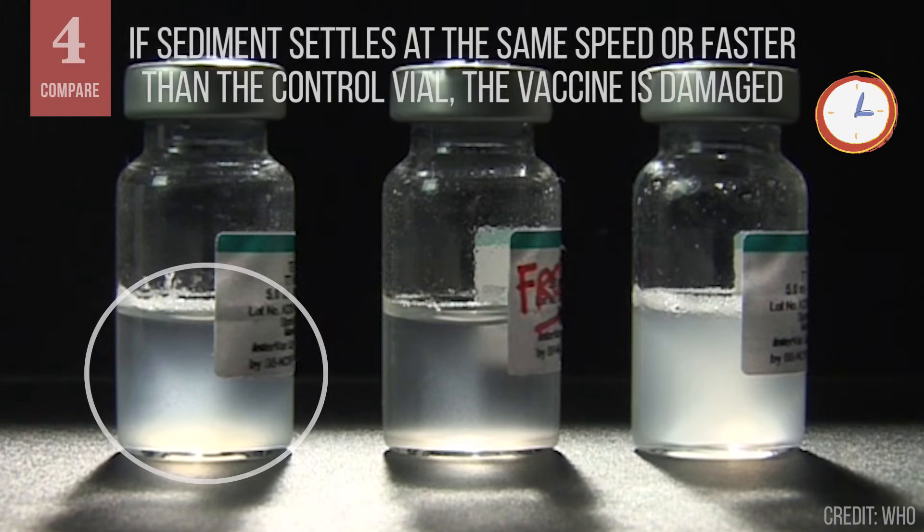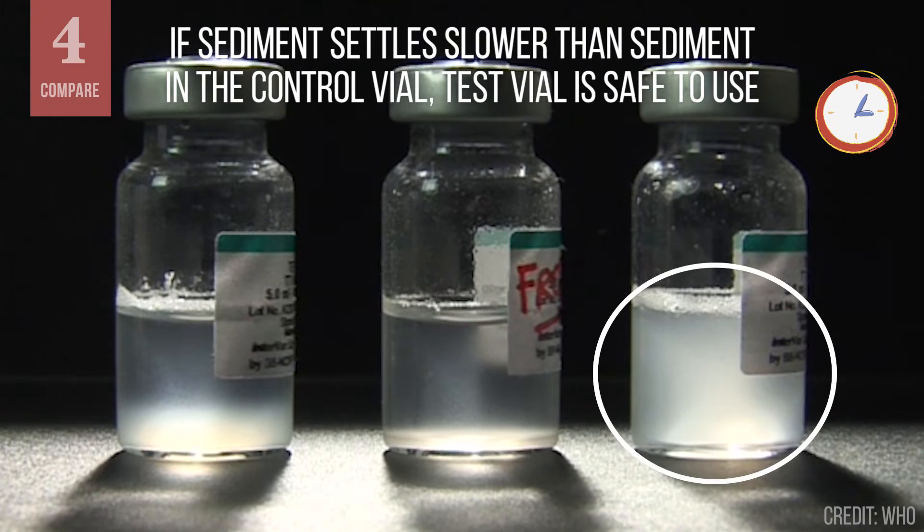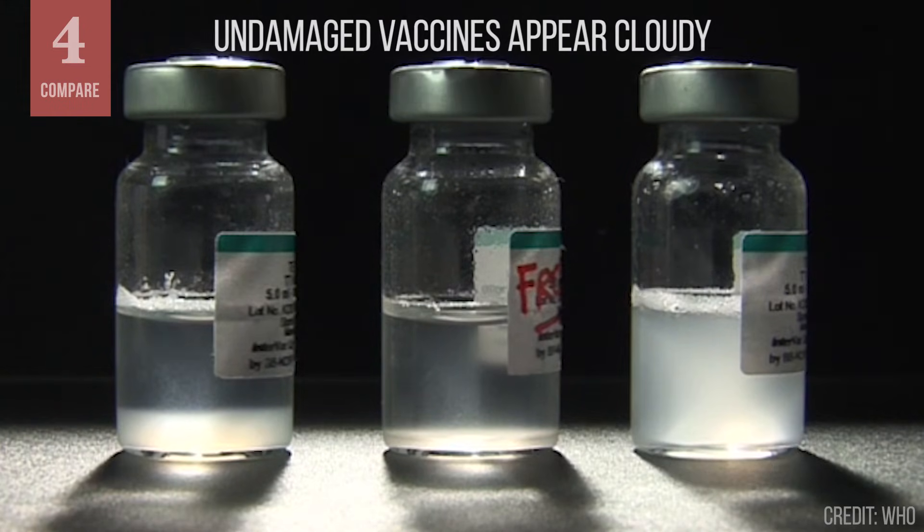If the sediment in the test vial settles at the same speed or faster than sediment in the control vial, the vaccine is damaged. If the sediment in the test vial settles slower than the sediment in the control vial, you can conclude the test vial has not been frozen and is safe to use. Vaccines that have not been damaged by freezing look cloudy.